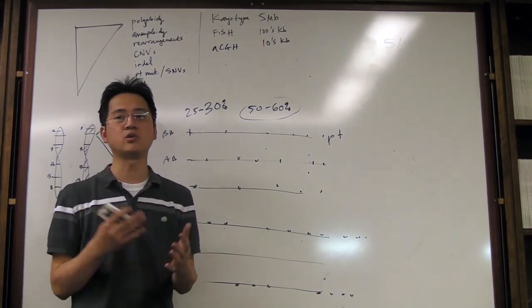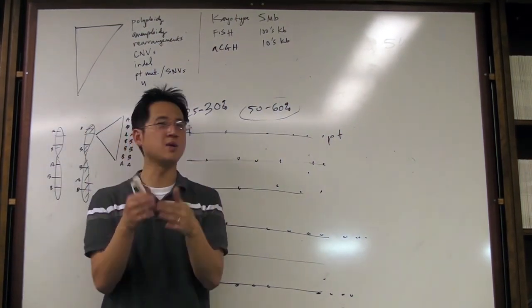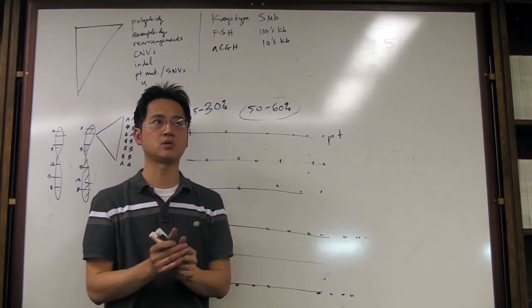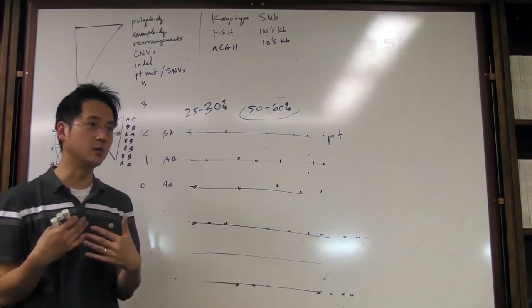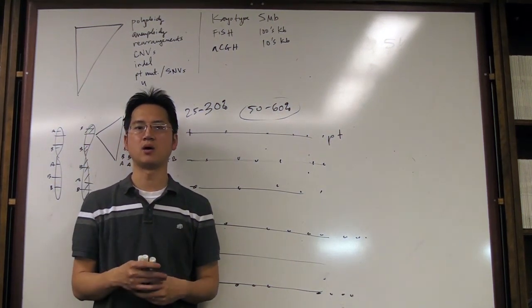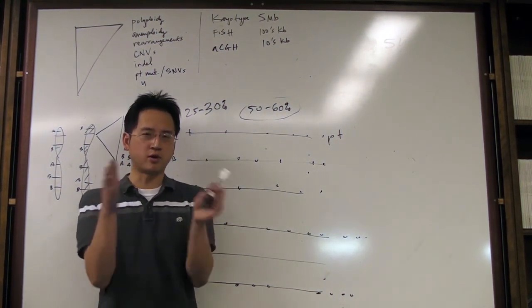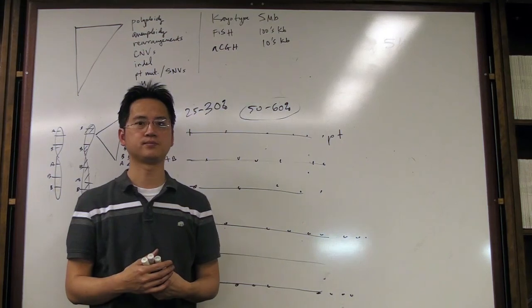So right now the challenge is how do you interpret that data? For pediatric cases, usually it's just one change, maybe two, and of the two, maybe one is abnormal and the other one is uncertain and is a much weaker call. It's a little bit easier to interpret that compared to, say, cancer. So for right now, I'd be a little bit anxious to launch it for cancer unless we had a legit database or more information about what to say. For certain diseases like multiple myeloma, where things are predictable, yes, you can say certain things about them because it's known, and it's very finite in terms of the number of calls. But otherwise, no, I wouldn't launch it for solid tumors quite yet. So I think we should stop.